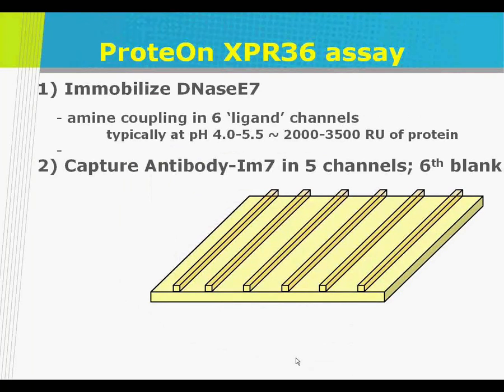We then rotate the fluidics, and inject the analyte, and again we monitor the association, and then by washing, in replacing the analyte with the buffer, we can monitor the dissociation phase. So as I said, you can analyze up to 5. Doing it this way, we were analyzing 5 clones at the same time. So you've already seen this. I'll just move on. So this just shows the data.